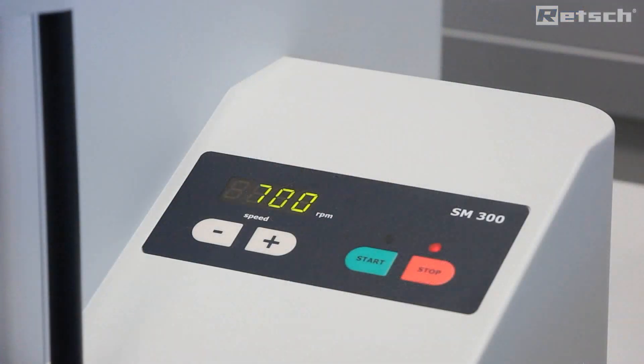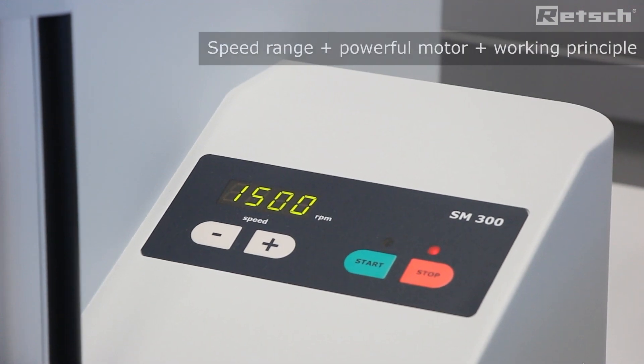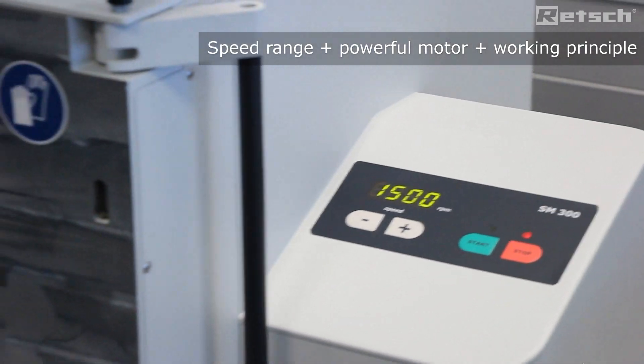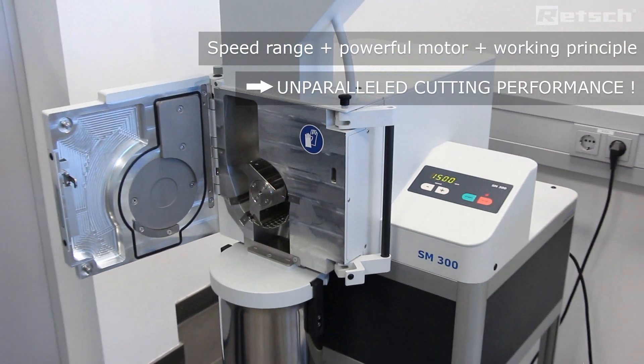Furthermore, the instrument can be run from a minimum of 700 rpm to a maximum of 3000 rpm according to the application requirements. Therefore, when combined with the use of the three kilowatt motor and the variable speed, this leads to unparalleled cutting performance.